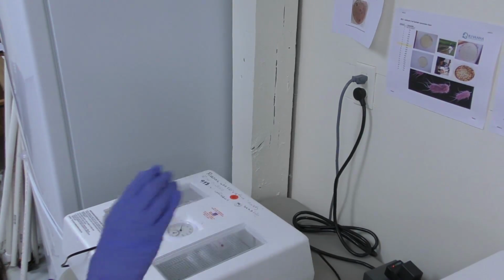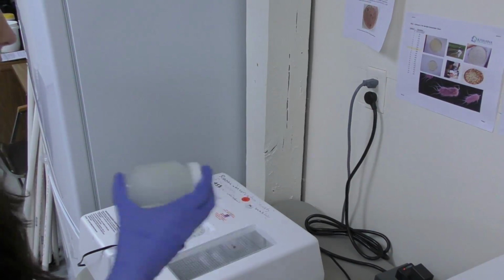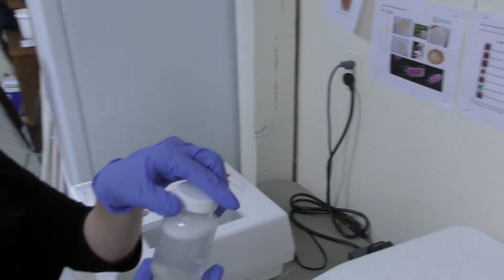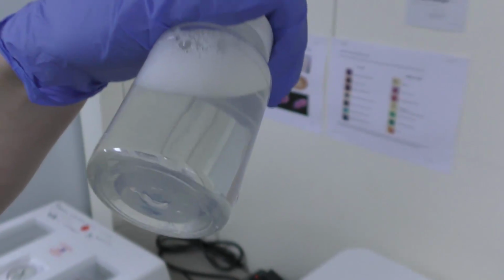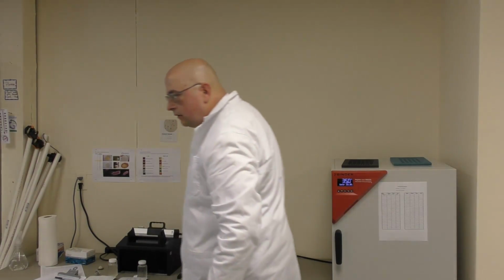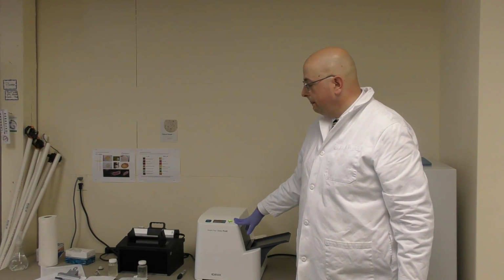So once the media has dissolved, you'll see here, and of course it's condensating in here, but there's no more powder in the bottom. And the water's taken on a little bit of a yellowish tinge to it, okay? So by about the time that you're done getting your samples prepared, your tray sealer should be about up and running. The light's green, and you can also hear the cooling fan running, all right?